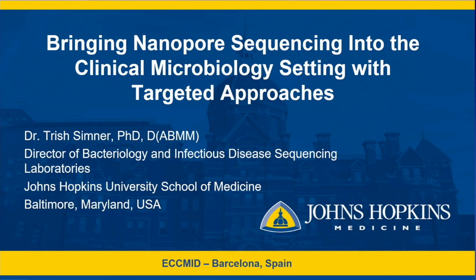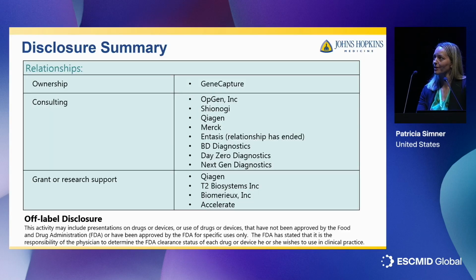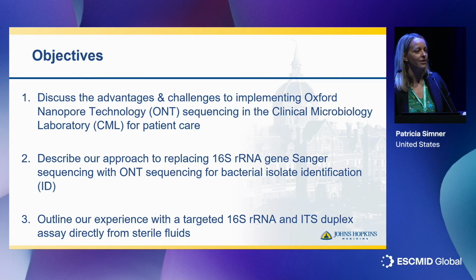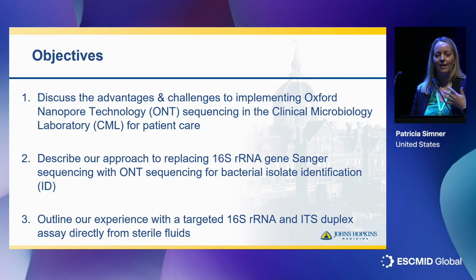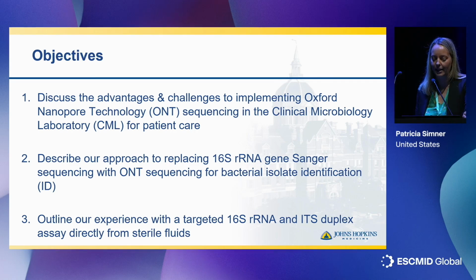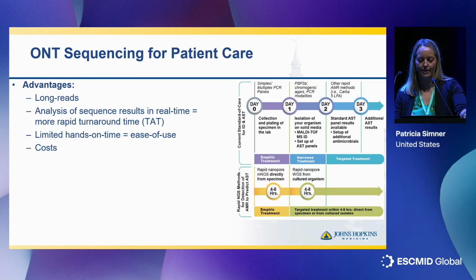Thank you, Justin. Thank you for inviting me here today, and thank you to everybody for sticking around. So today I'm going to be talking about bringing nanopore sequencing into the clinical microbiology setting with targeted approaches. Here are my disclosures. And so my objectives are to discuss not only the advantages of nanopore sequencing, which Justin highlighted so nicely, but also some of the challenges that we face in the clinical setting, and then describe two different scenarios where we've wanted to implement nanopore sequencing for patient care purposes.